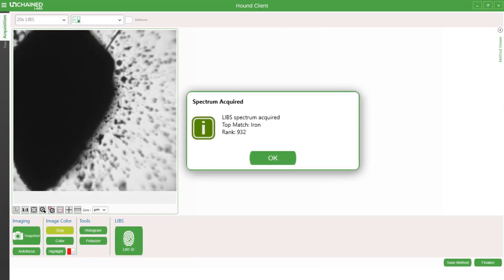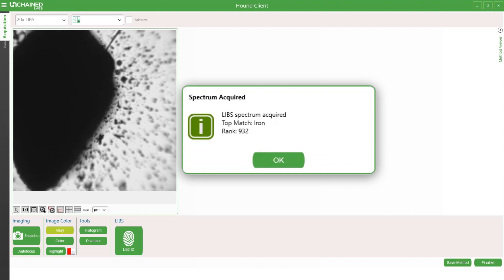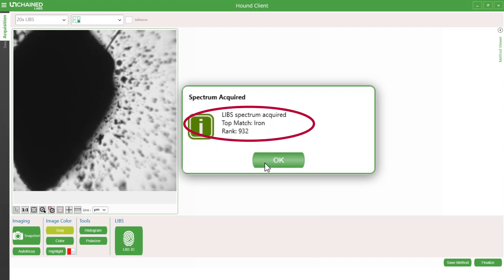In this case, the particle is made of iron. The instrument identifies the material and provides a match rank out of 1000, which is the strength of the correlation between my particle spectrum and the database.